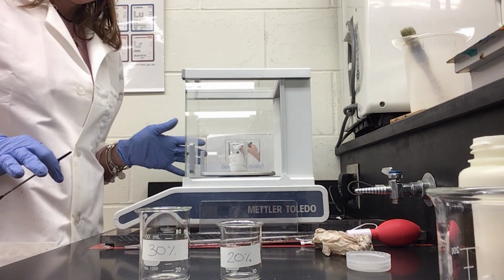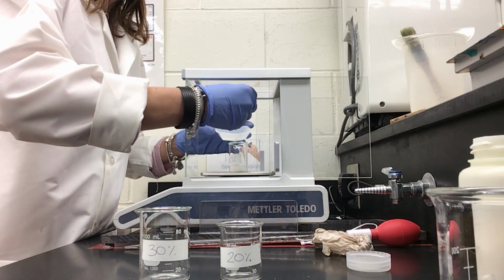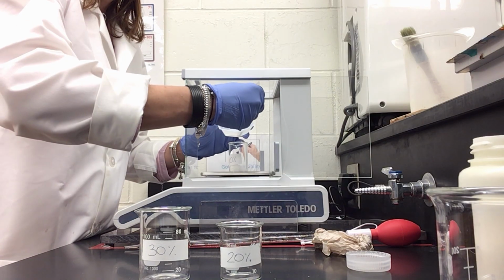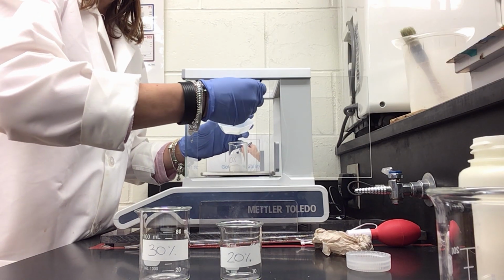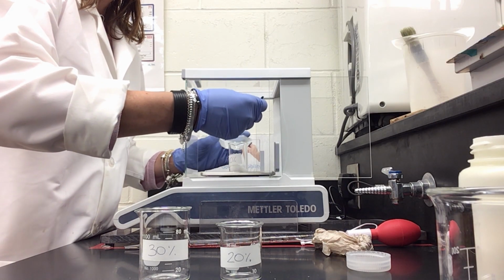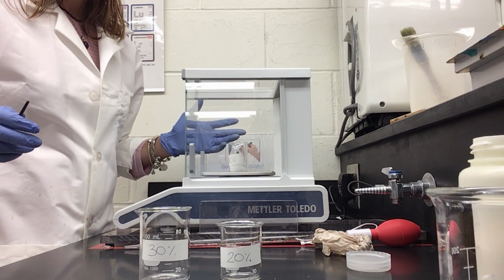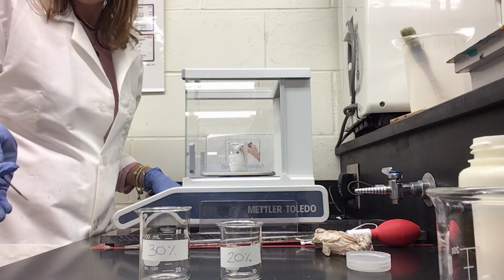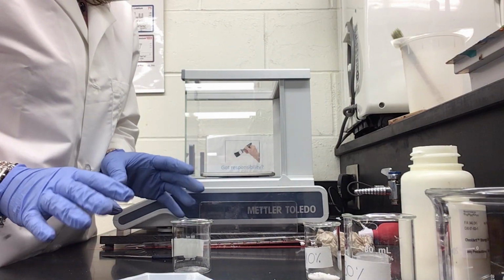Now I took too much, so I'm gonna open again and I'm gonna add just a tiny bit. So now I'm at 3.47, 3.49, I am so close. Okay, it's 3.504, so that's acceptable. So now we're gonna do the same thing with the 20%.